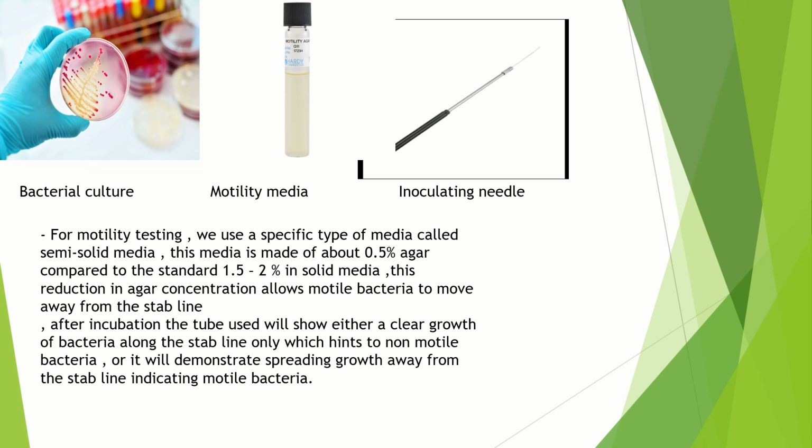After an incubation, the tube used will show either a clear growth of bacteria along the stab line only, which hints to non-motile bacteria, or it will demonstrate a spreading growth away from the stab line, indicating motile bacteria.